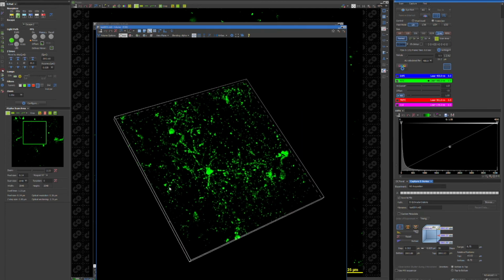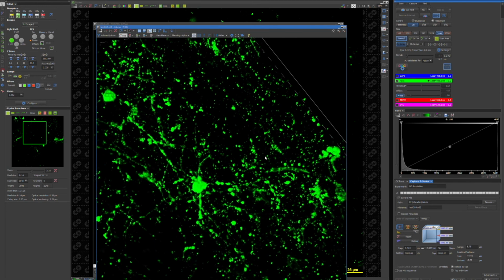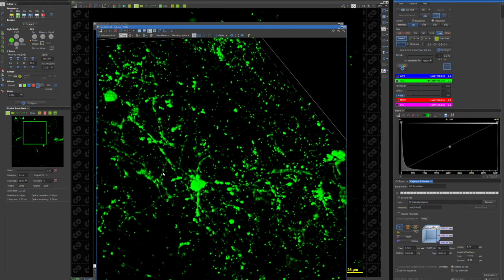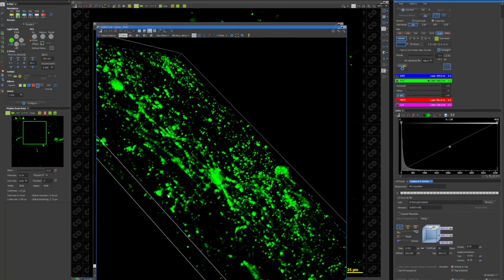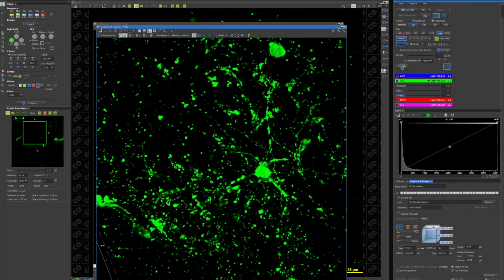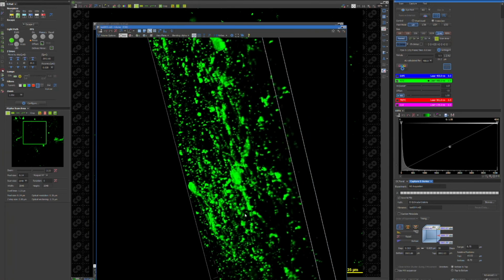I feel like a lot of the time neurons are portrayed as being very orderly and possessing just a few meaningful connections. But that's not true. Connections can change, and connections are messy. As neurons learn, they position themselves like contortionists in order to get the most function out of its many extending limbs. And it's honestly so beautiful. I'm really excited how this region turned out.